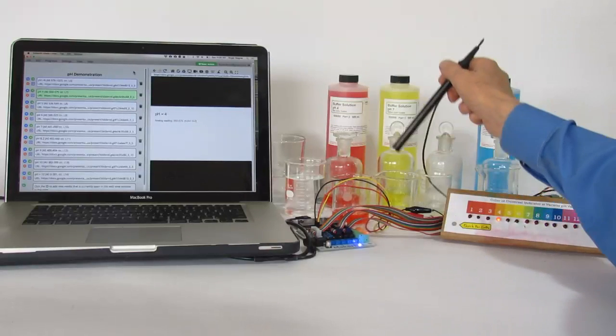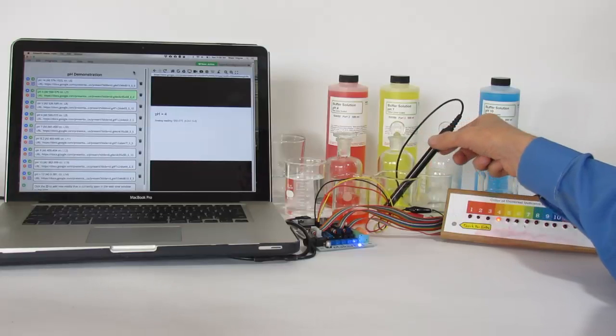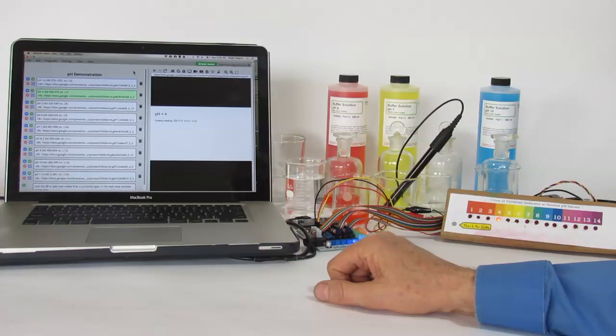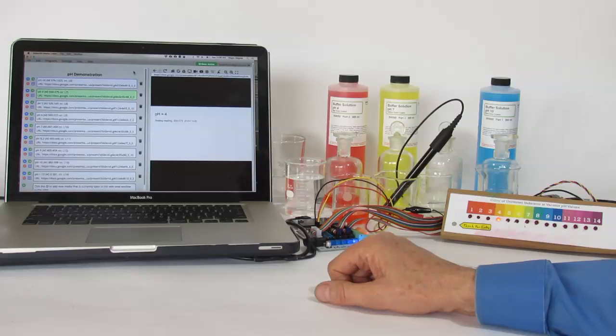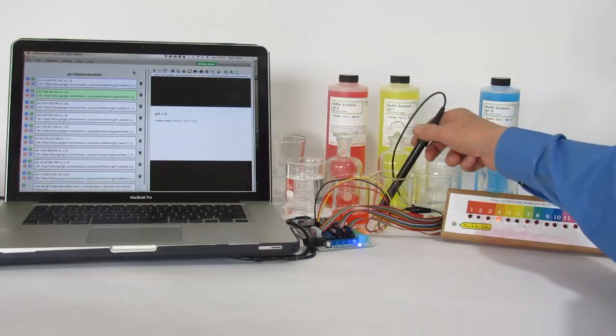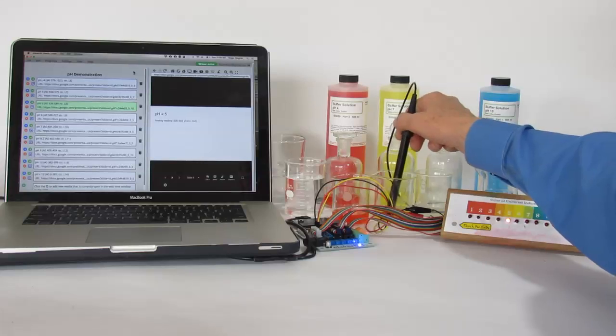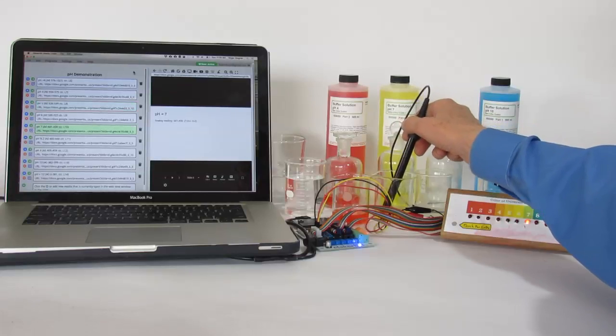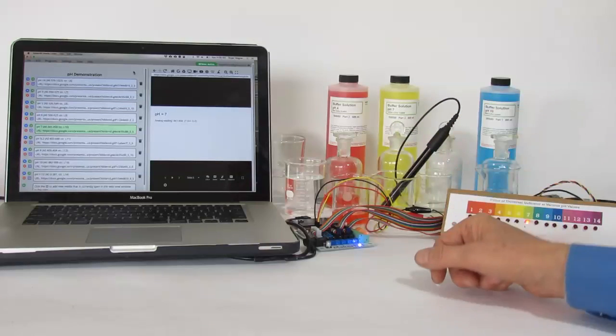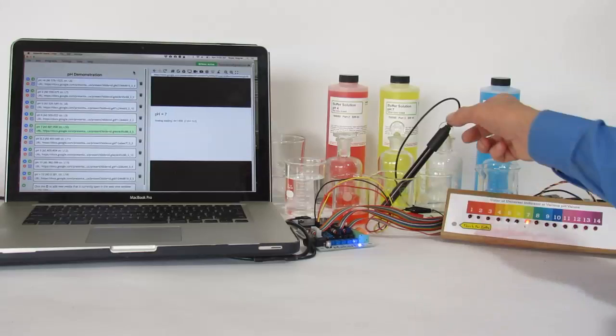We'll move it to buffer solution pH 7, and the probe takes a little bit of time to respond. There we are, 5, 6, and 7. So now the Google Slide is on 7.